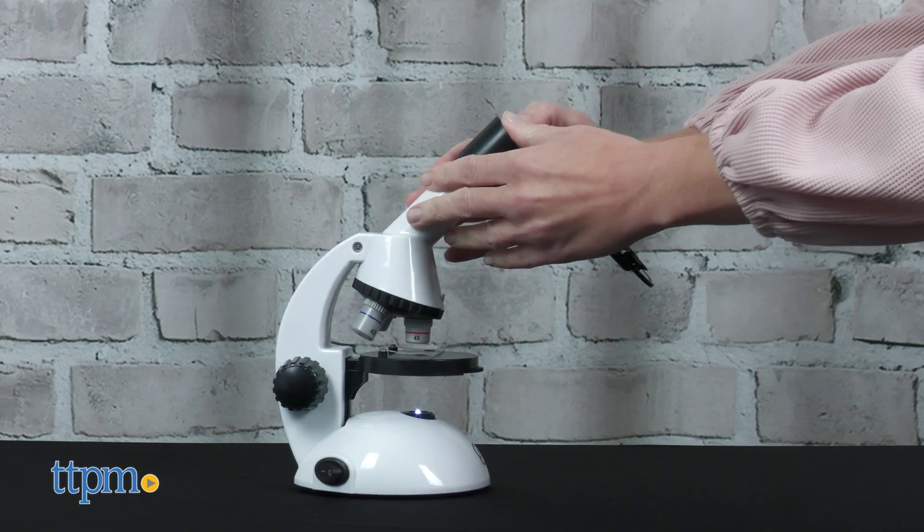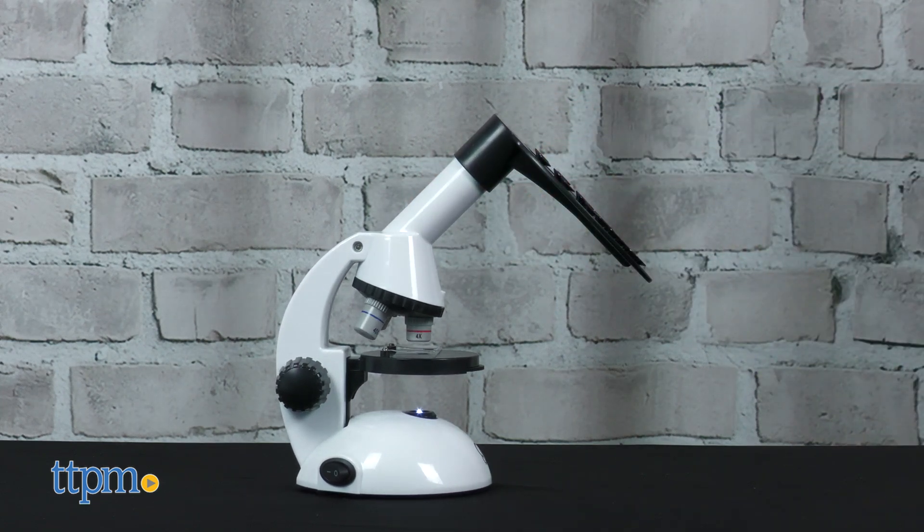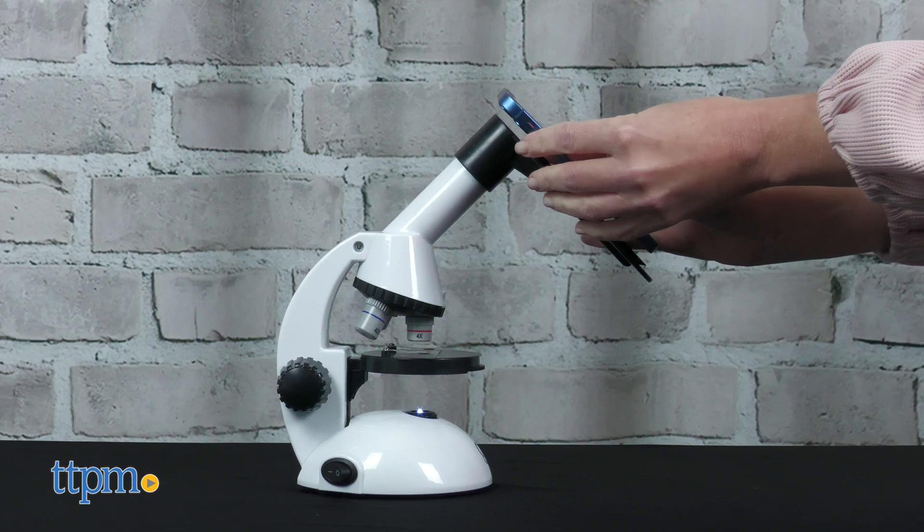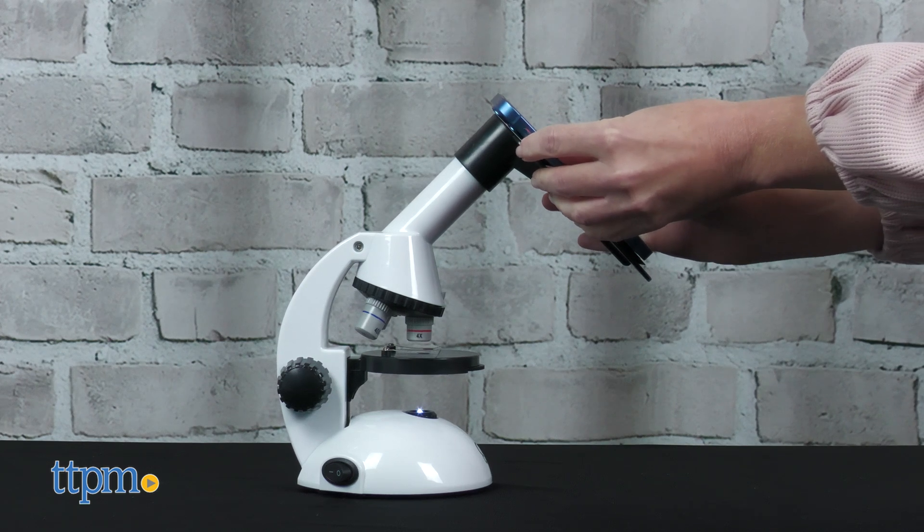You'll need two AA batteries, and of course a smartphone is not included. We like how this microscope encourages kids to explore, though I wish that viewing through a smartphone had produced better results.